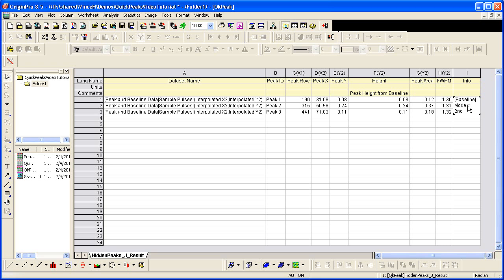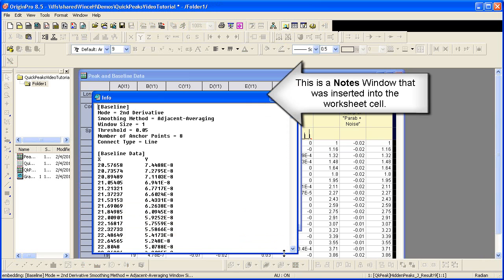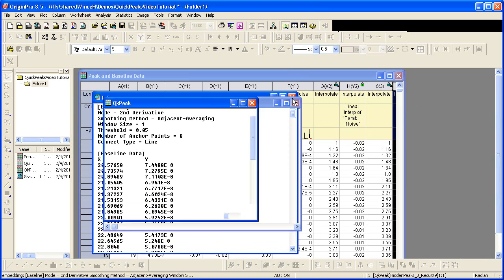Also, the baseline that was used can be found by double-clicking and bringing up an information window that contains the baseline coordinates.